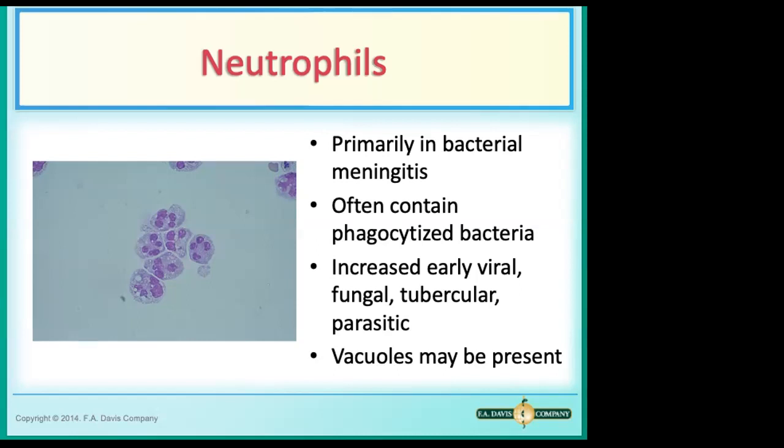And oftentimes what you'll see is neutrophils with cytoplasmic vacuoles that result from the cytocentrifugation. So these are little tiny holes in here. These are vacuoles, and sometimes it doesn't mean anything, but it was the force of the centrifuge, because we're trying to force these cells to stick to the slide, and that is causing some sort of distortion, right? Even though we put the albumin in, we don't want that to happen, but it's going to happen regardless.